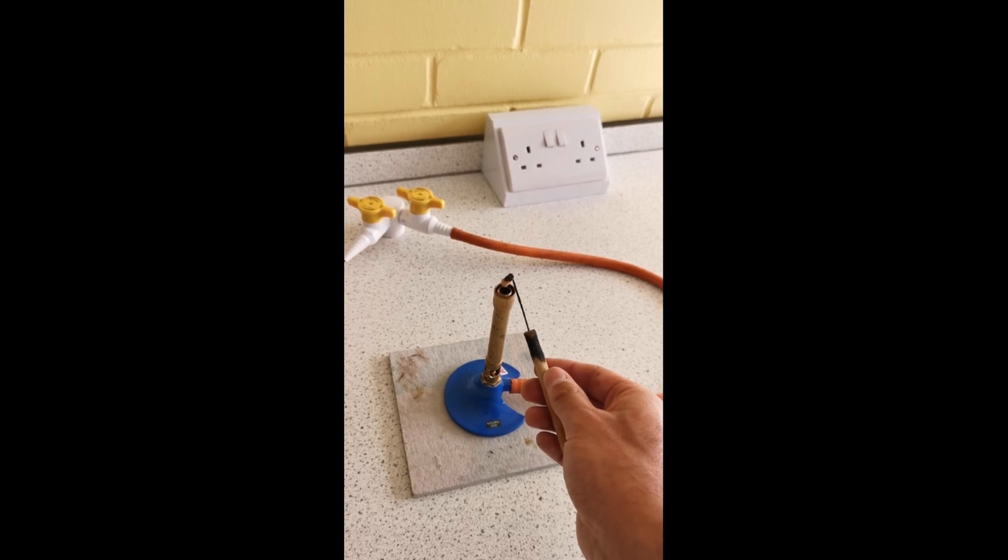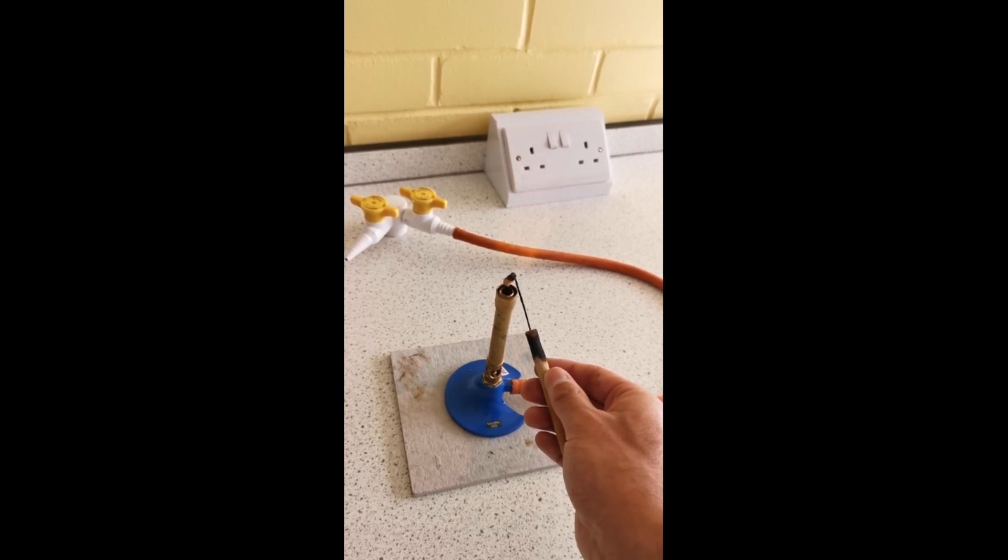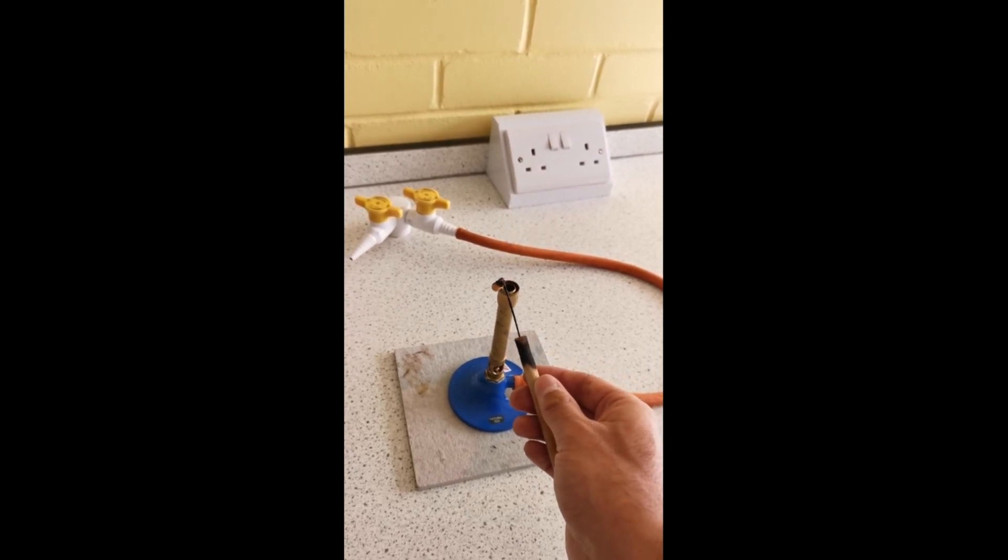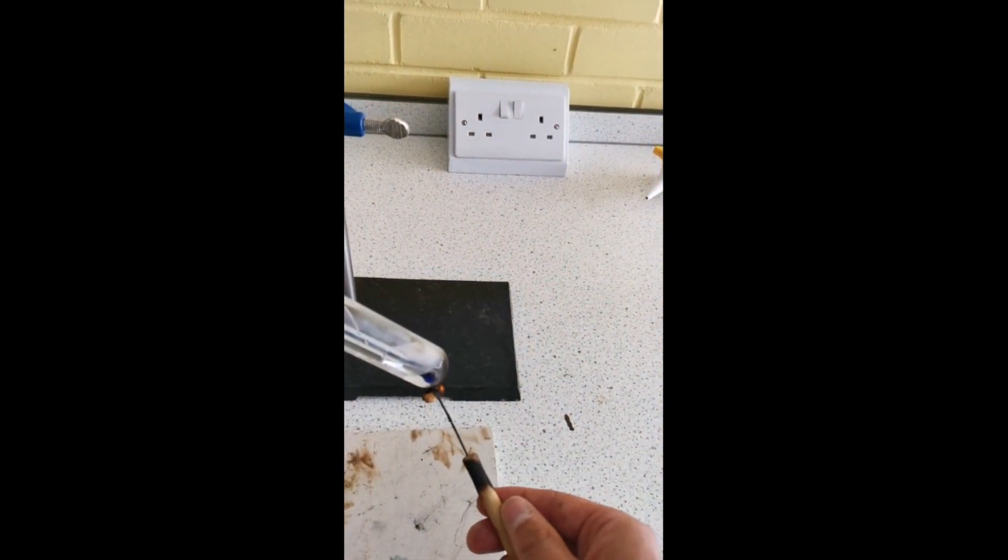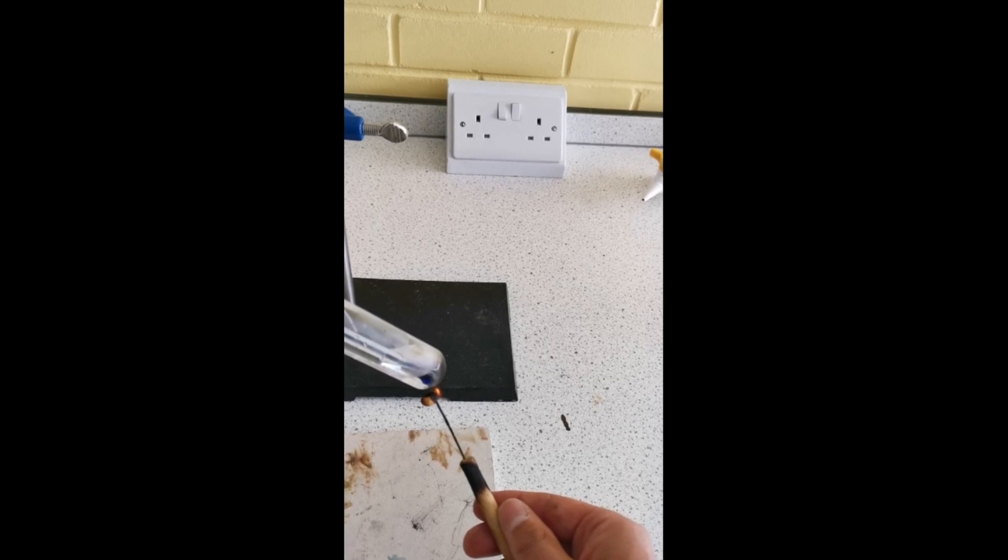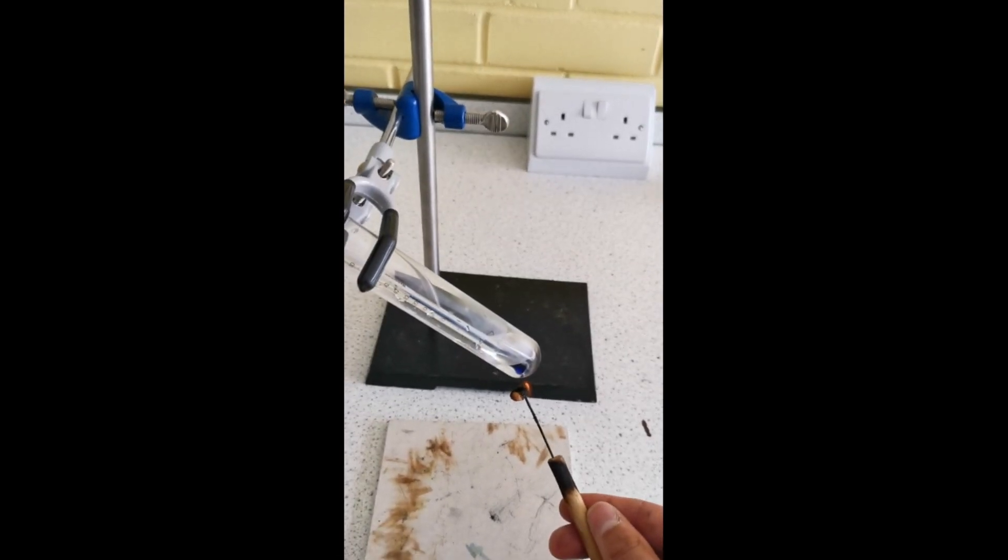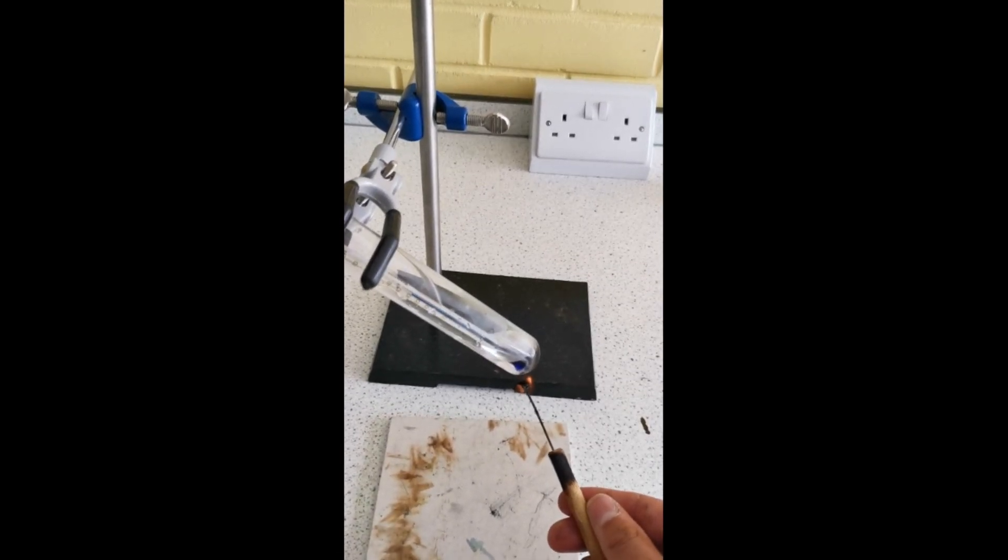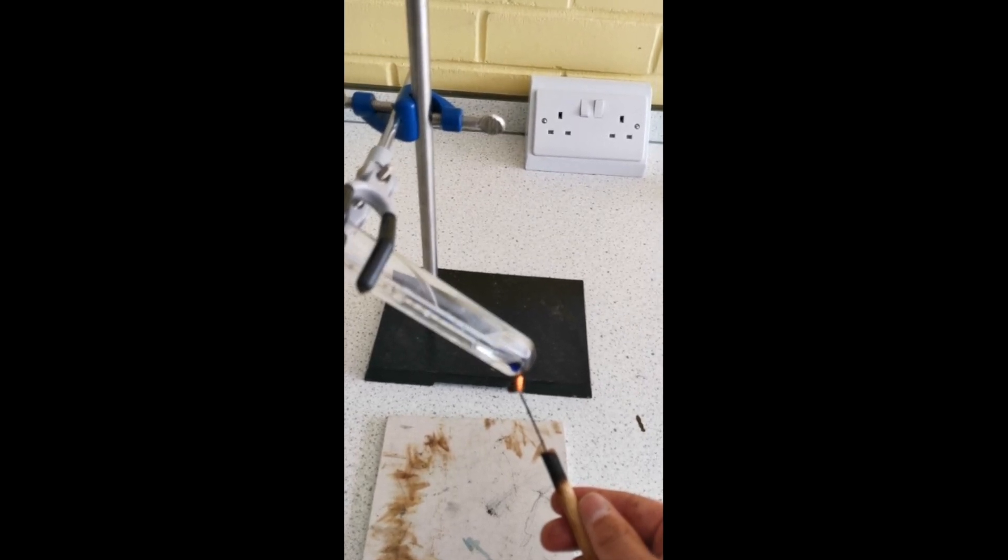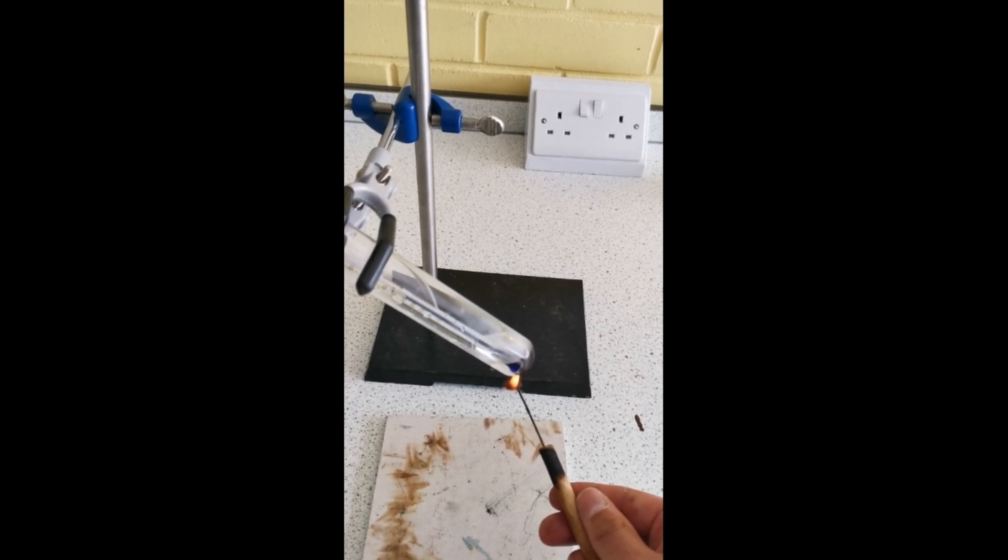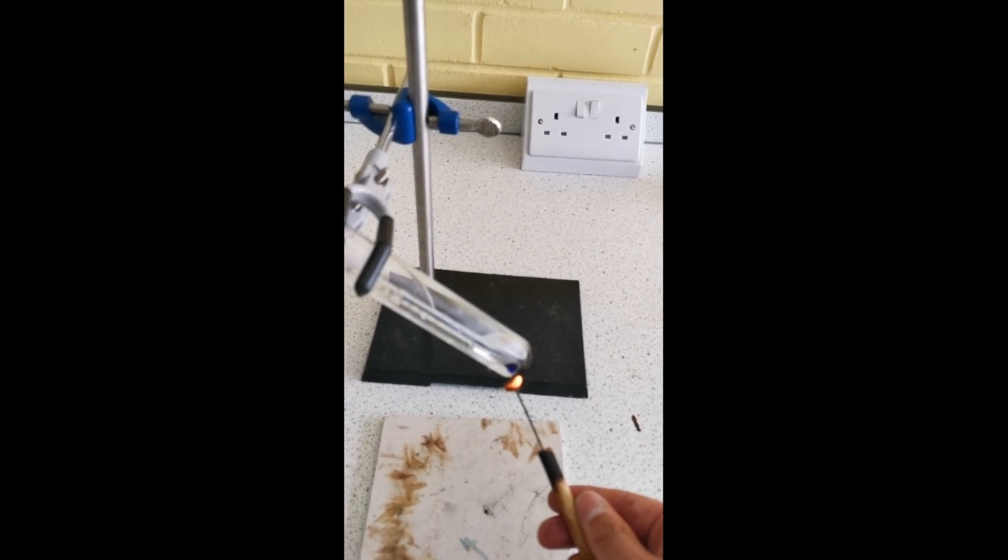Wait for it to light. Then hold that flame back underneath the boiling tube, and you want to do this until all of the food is burned. You want to release all of that energy from the food and use it to heat the water in the boiling tube.